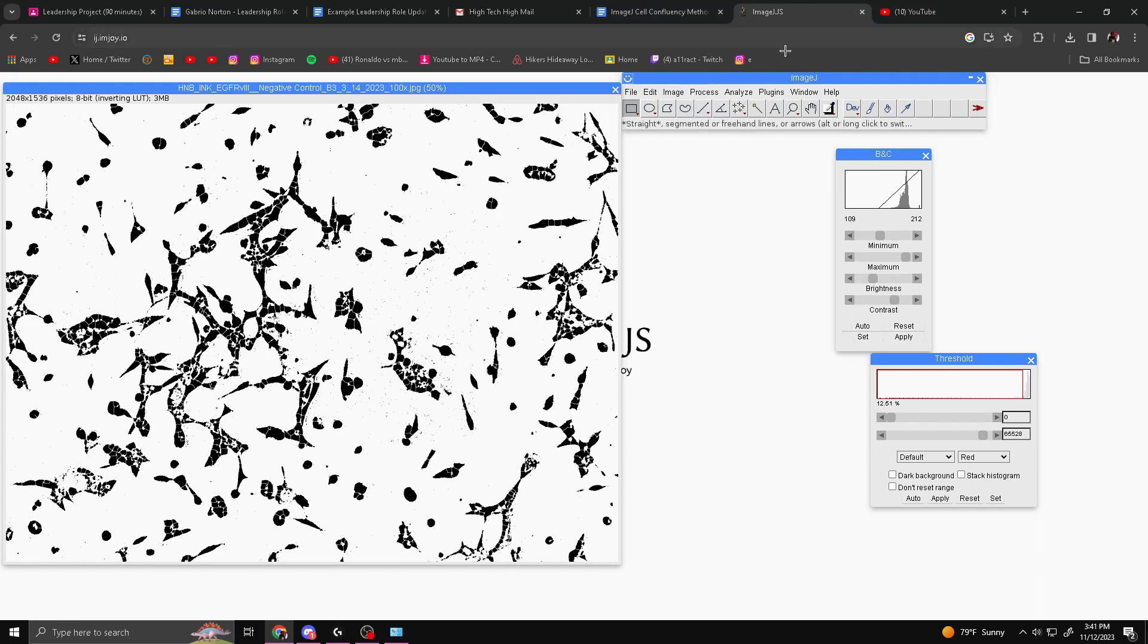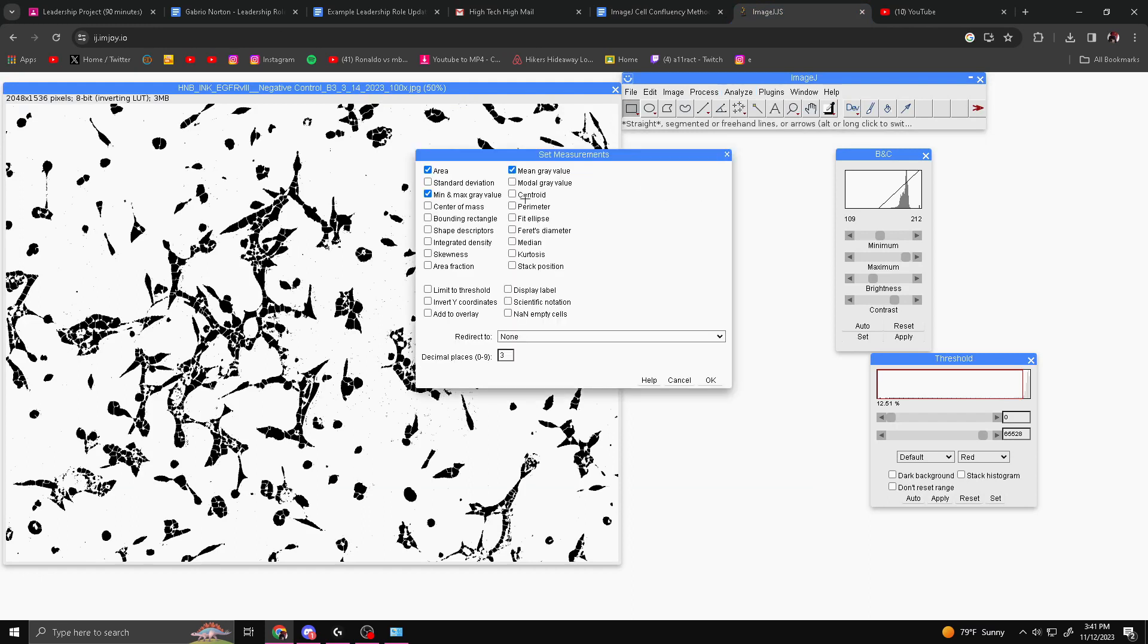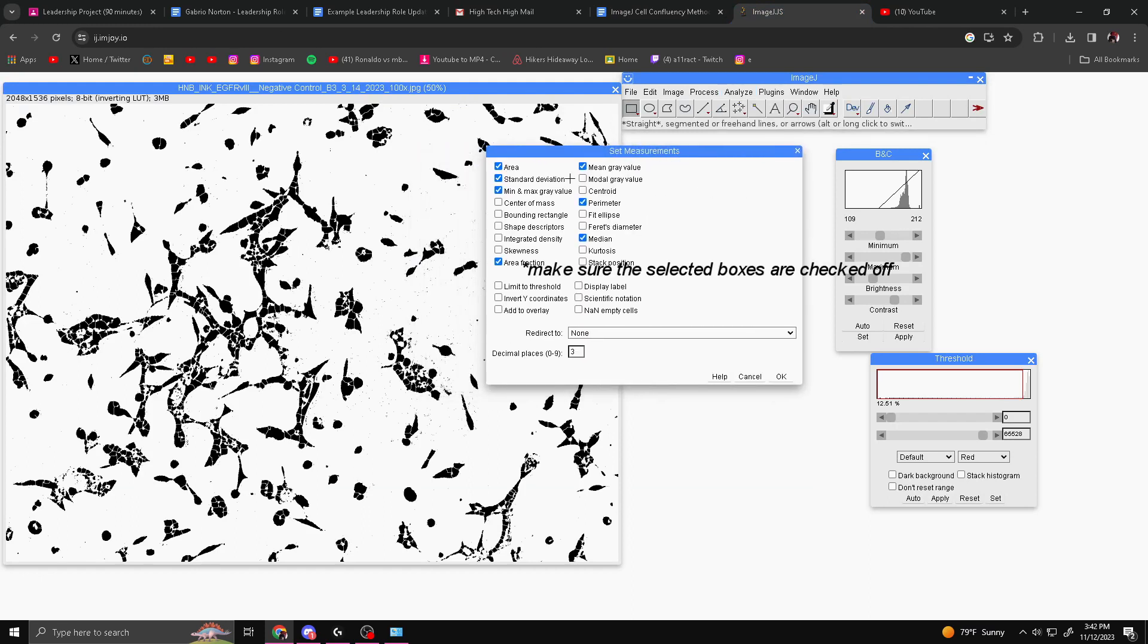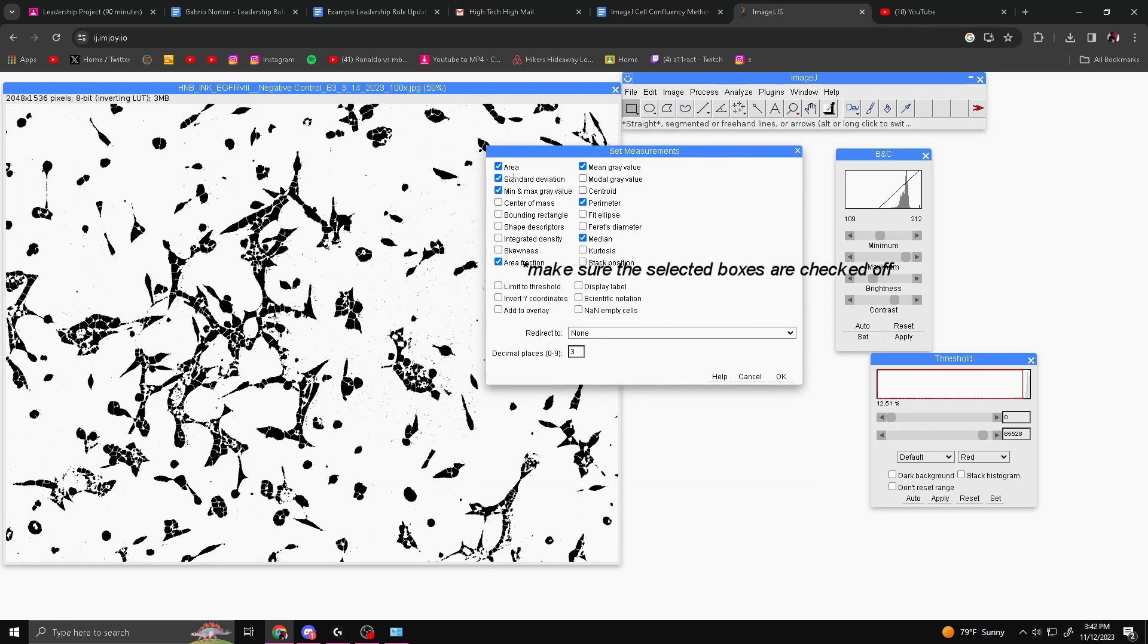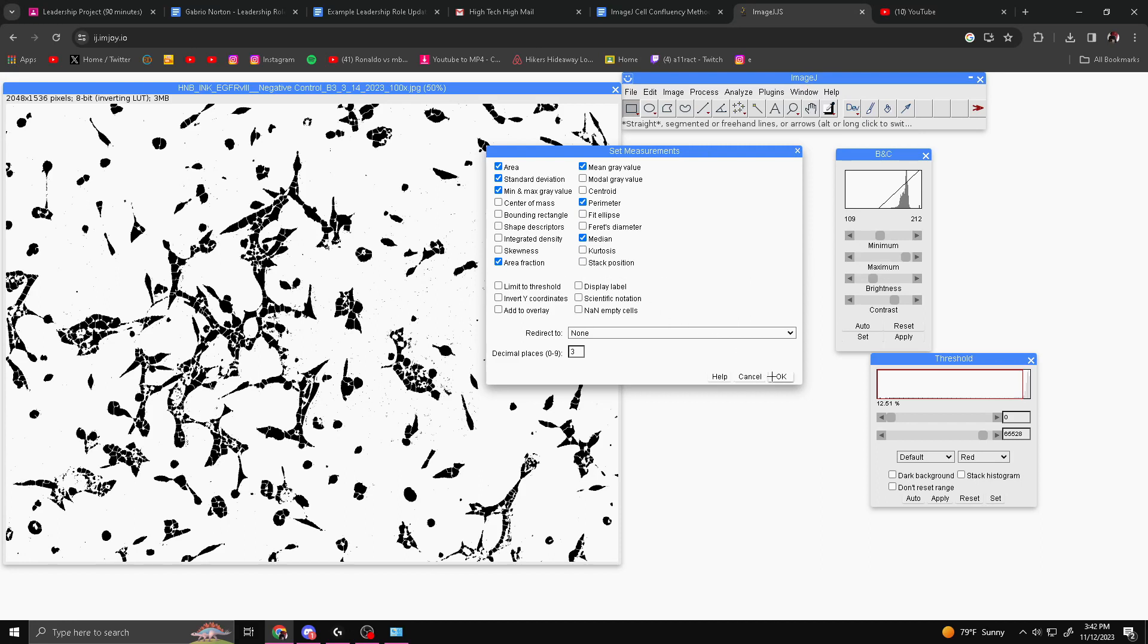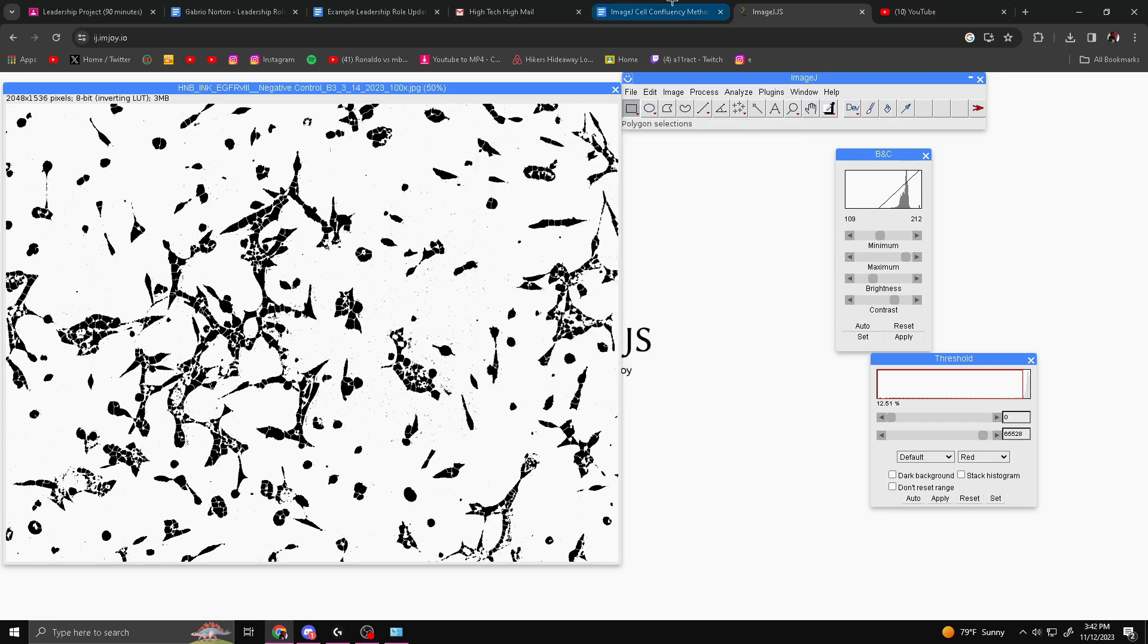Next, you're going to go to Analyze, then Set Measurements. Once you have that opened up for the measurements, you want to select Area, Standard Deviation, Min and Max Gray Value, Area Fraction, Mean Gray Value, Perimeter, and Median. Then you're just going to hit OK. As you can see, it will change the image slightly, and that's perfectly fine. This is what you want.